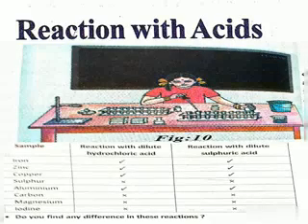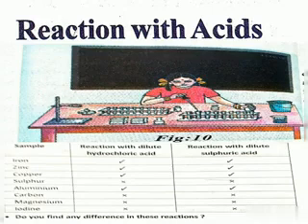Students, in the previous class we discussed the reaction of metals with water and with oxygen. Today we are discussing reaction with acids. Take the samples given in table 8 in separate test tubes.